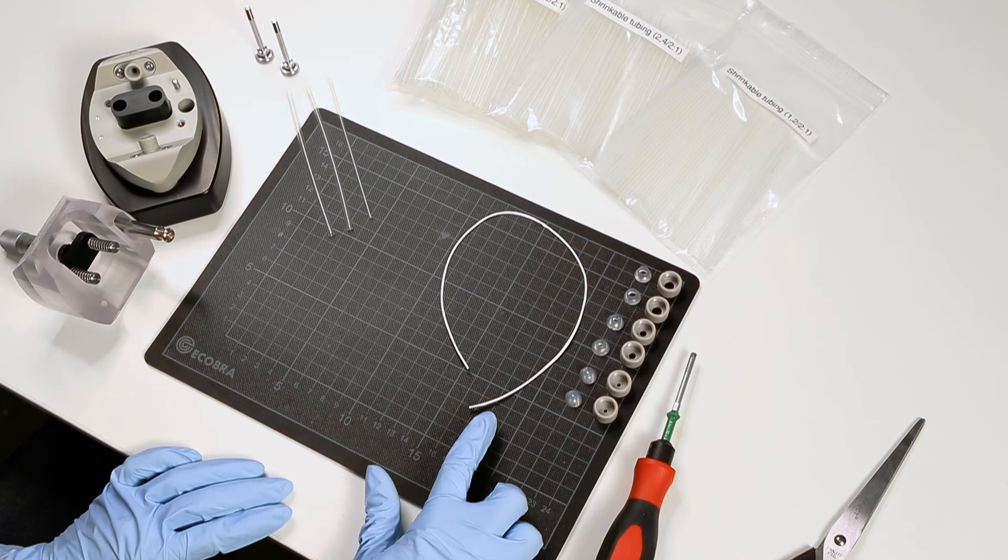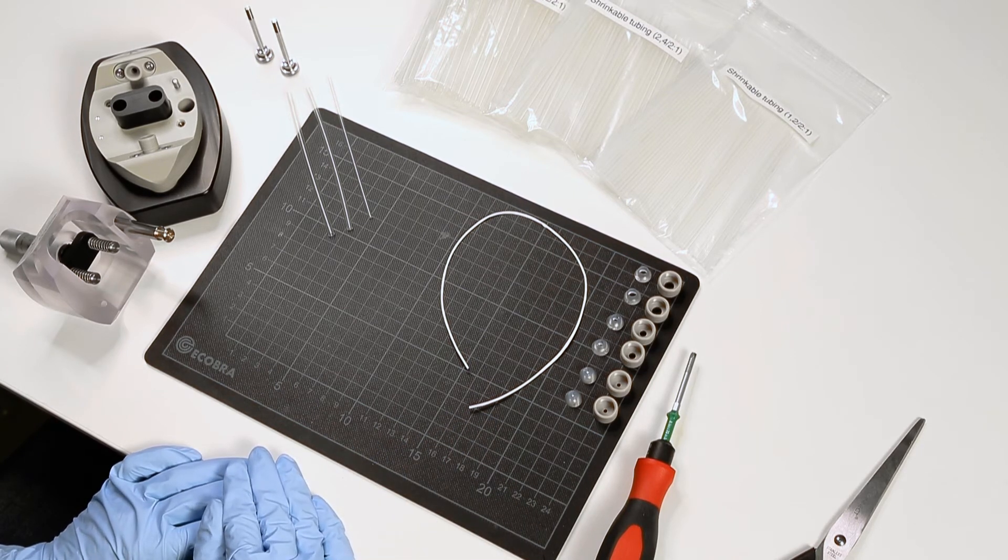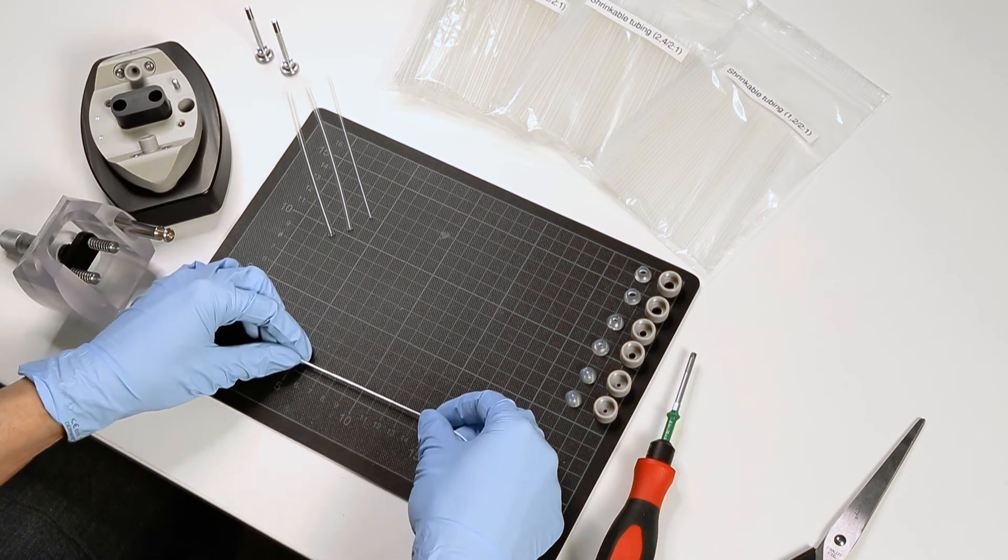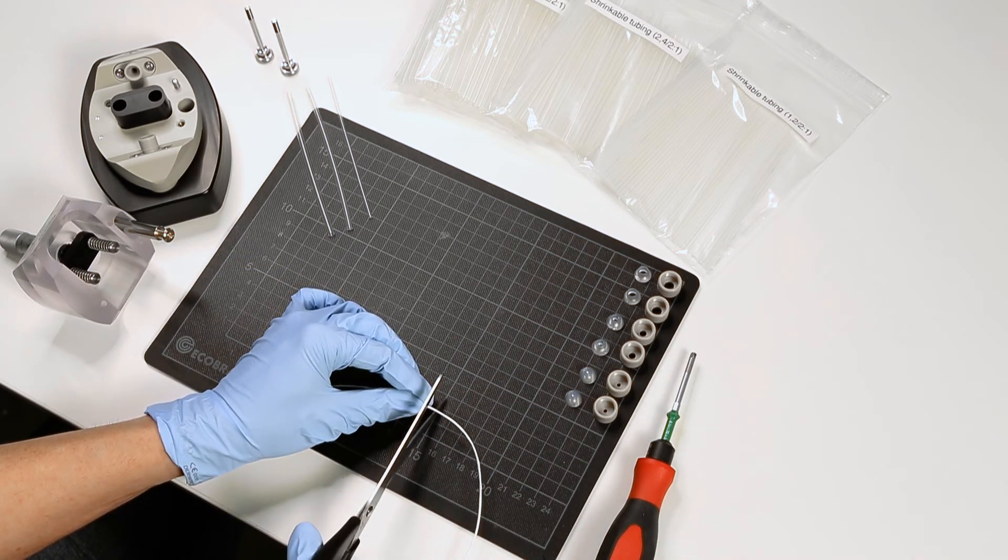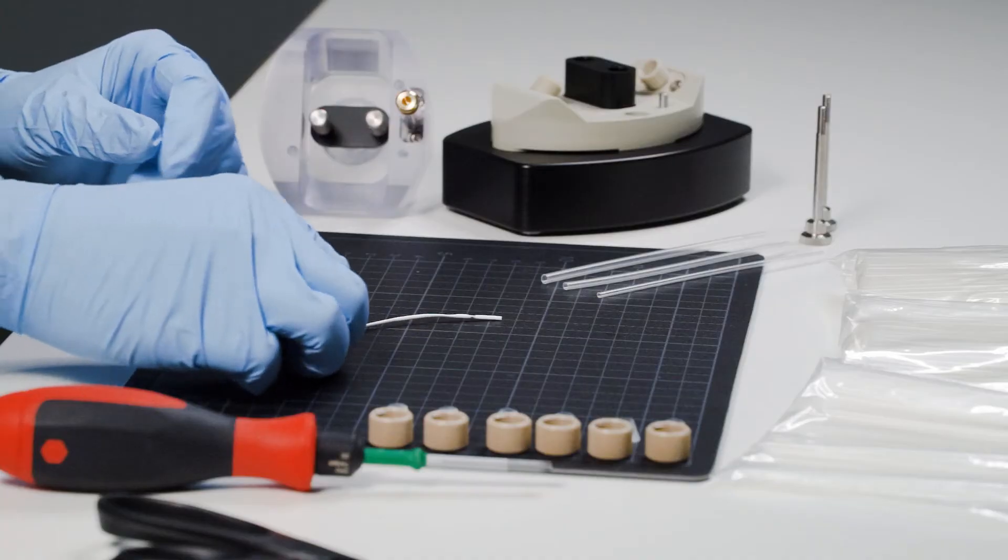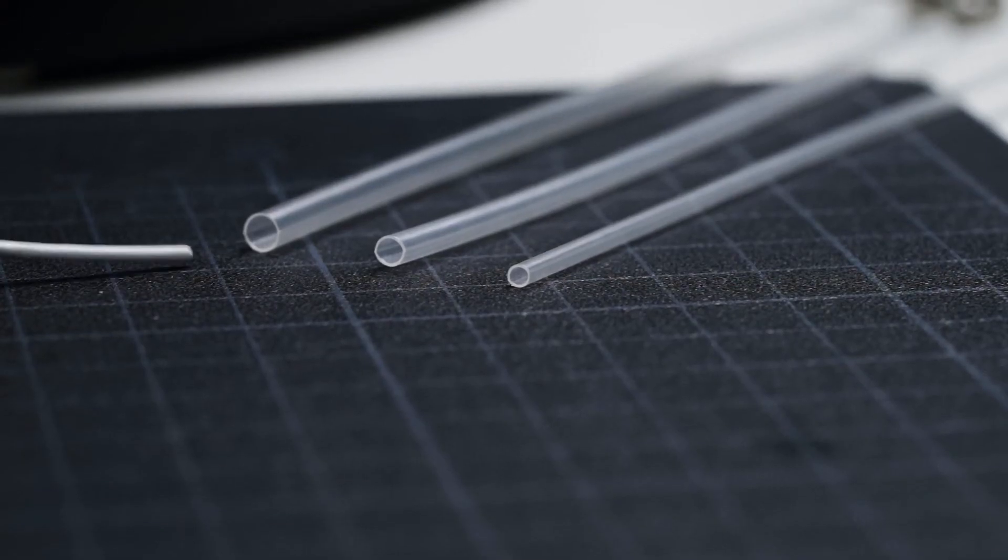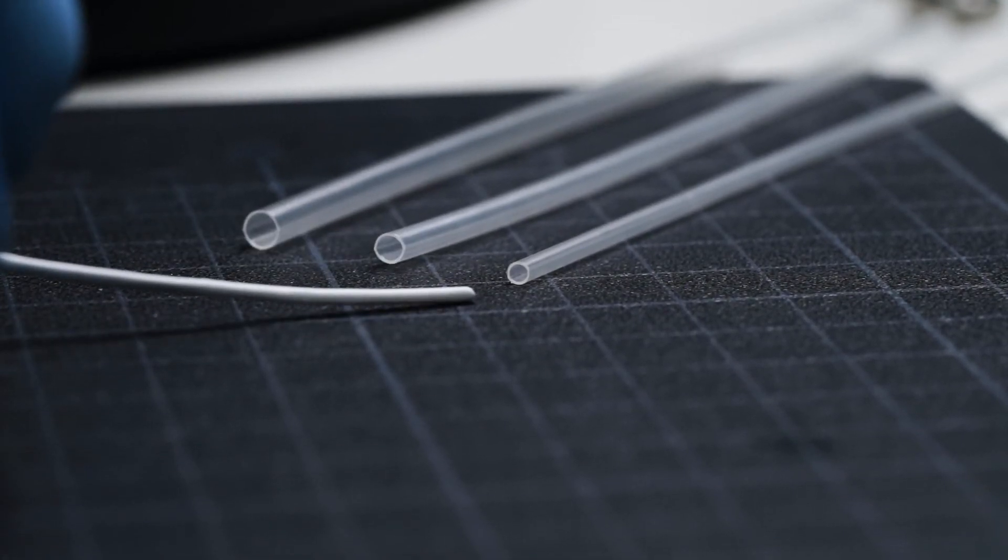For mounting a hollow fiber sample, we follow a similar approach. We disassemble the flexible tubing cell to access the sample compartment. Again, we start with a sample length of minimum 10 cm. Select a heat shrink tube with its inner diameter closest to the outer diameter of the hollow fiber membrane.